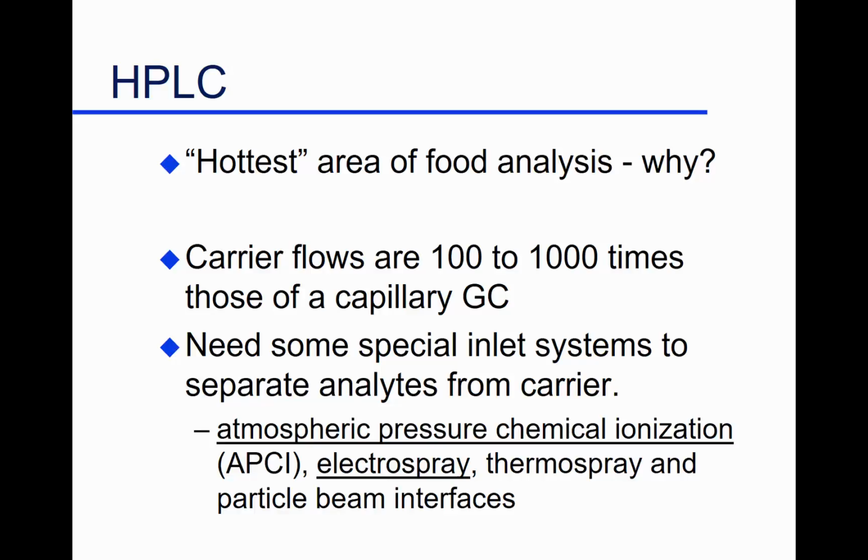But it's not what's in the food, it's what's given up to the breath to get up here. And so our techniques now permit us to measure the stimulus that you were given up in your olfactory region. So we take the inlet of our mass spectrometer, put it up your nose, then you swallow that beverage or that food, and I can tell you exactly what stimulus you were given and what you respond to. So we've taken the food out of it, because most of our flavor ends up in your stomach. It's gone. It doesn't get released for smelling. You swallow it, it's gone.